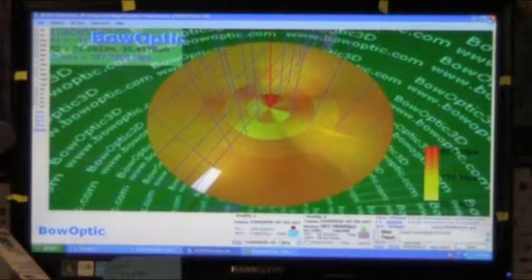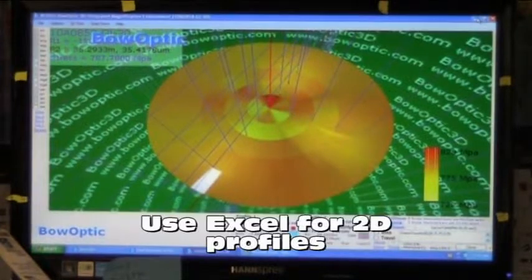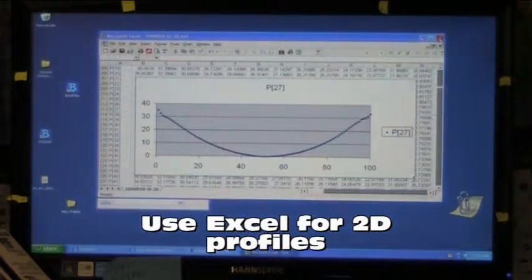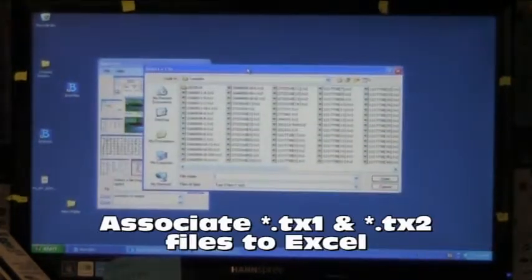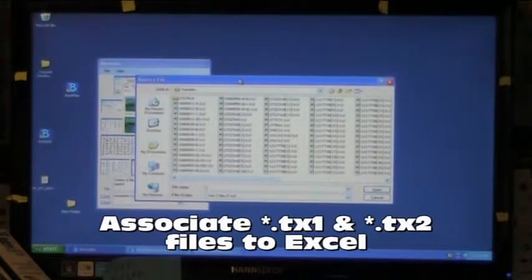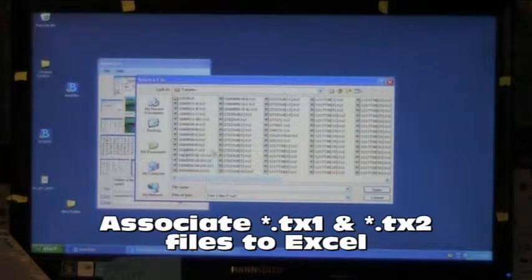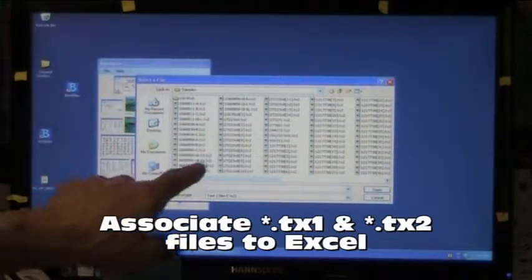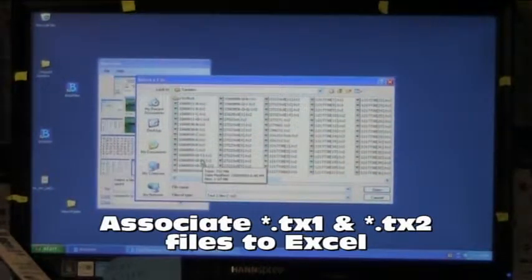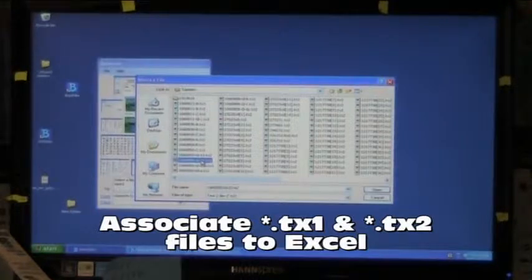I will open the data in Excel with file association. I open a Windows file dialog box, select the file, right click on it, and select open with to set up the file association.